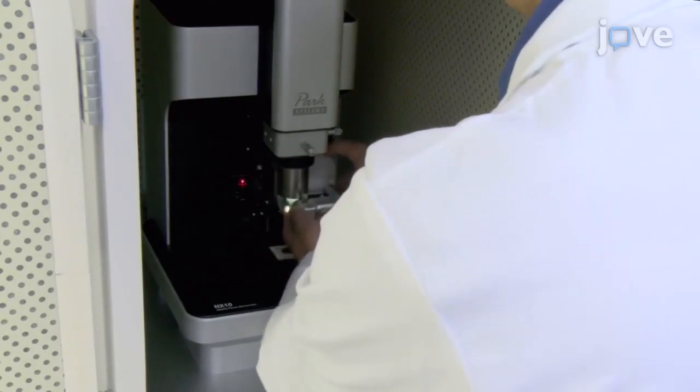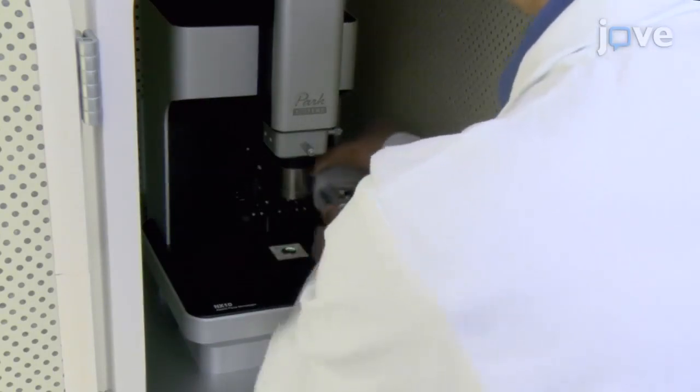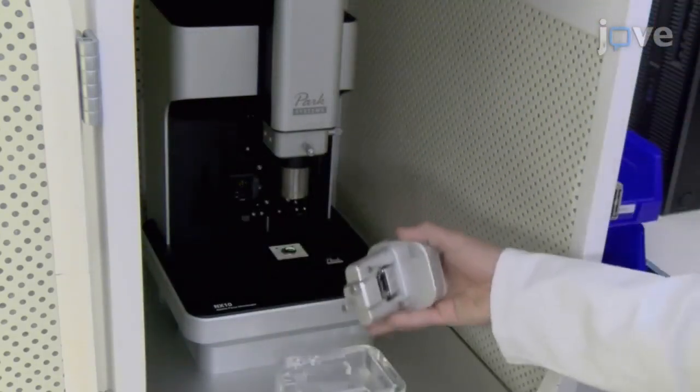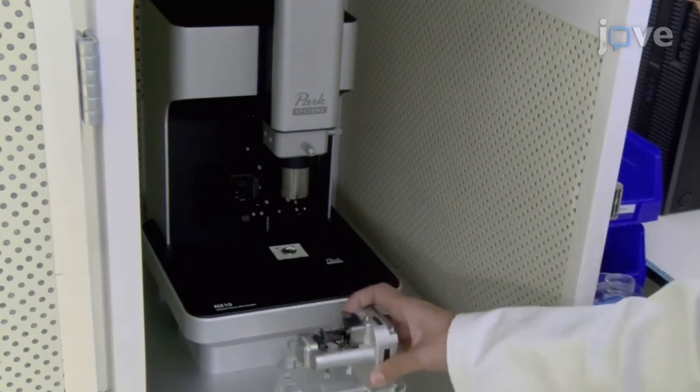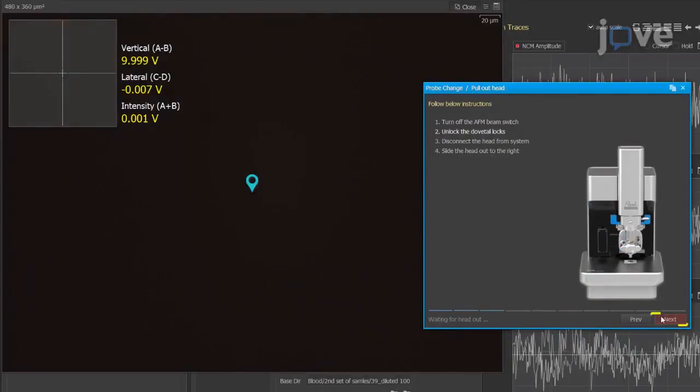Disconnect the head from the system, and in the Probe change window, click Next.